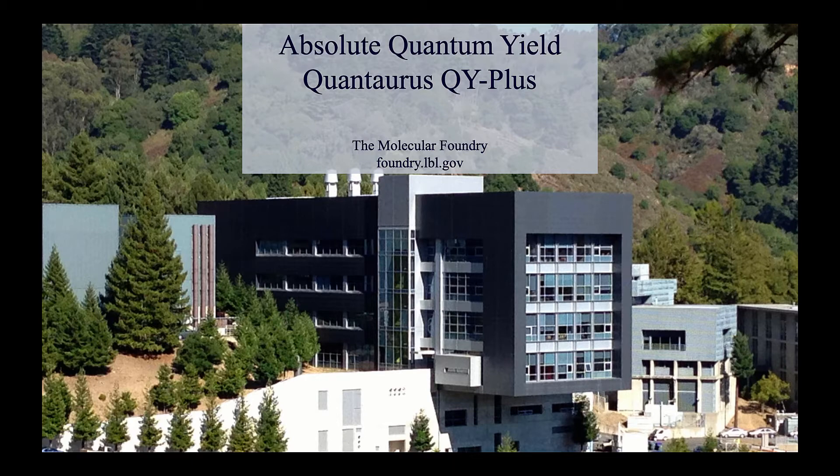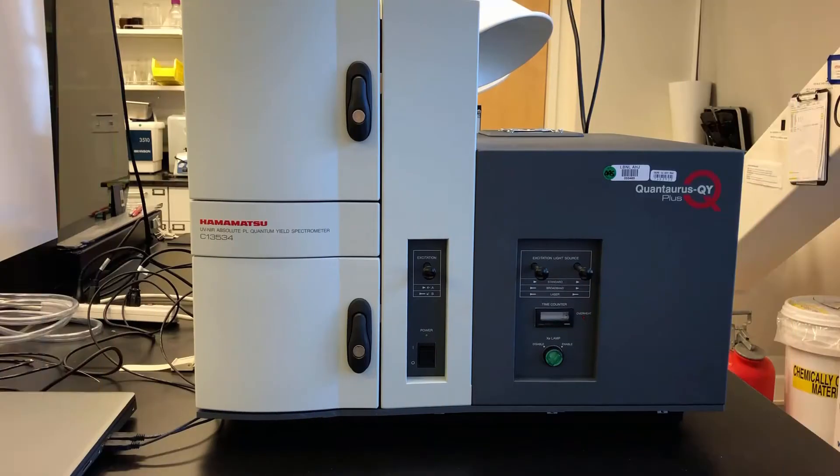This is training for absolute quantum yield measurements with the Quantaris QY Plus spectrometer. I'll show you how to load different types of samples and we'll run a quick scan.